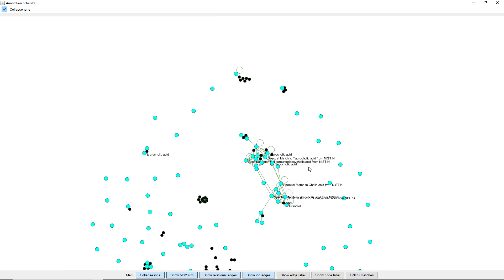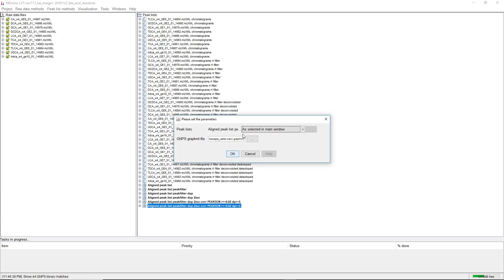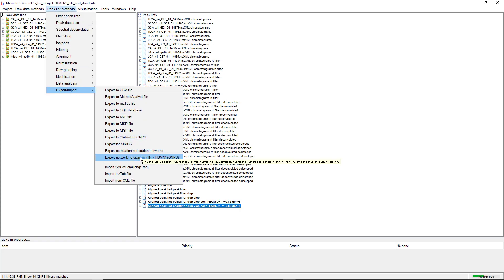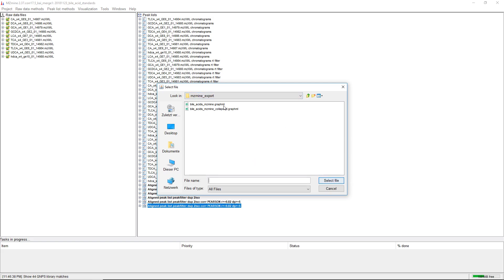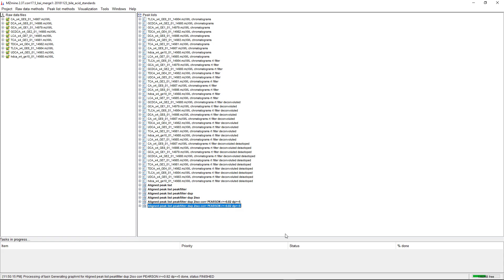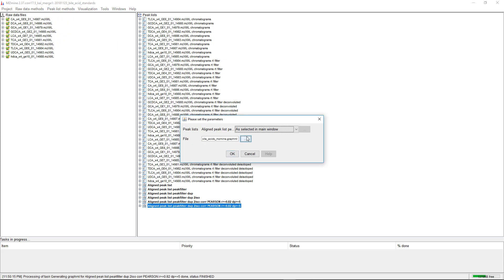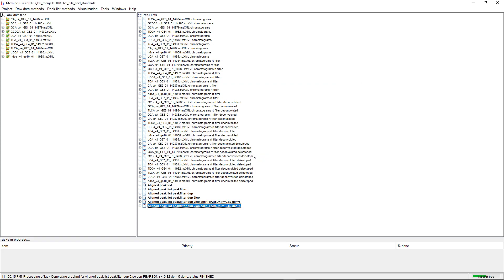We can also import the data to MZmine and then export to Cytoscape. We go on Identification, Import GNPS Results to the feature list, and then Export, Export Networking, GraphML. We choose a location and hit Export. This export function creates two files: one is the collapsed version and one is the non-collapsed version. This is different from the direct download function of GNPS, and the collapsed version is much easier to visualize in Cytoscape.